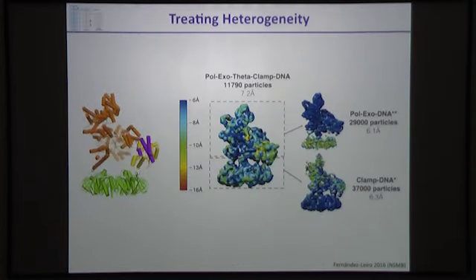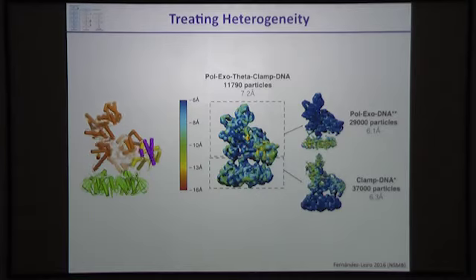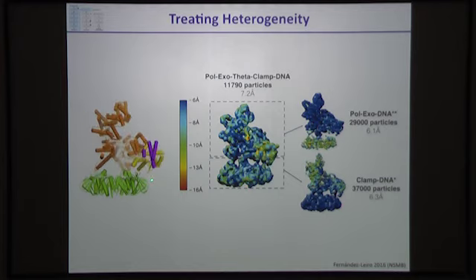This is another example from our polymerase data set, and I think it's quite illustrative of what can happen. This is a 220 kilodalton complex, and what I'm showing here is the range of movement that the particles are undergoing when you're freezing them. These are three different proteins bound only by a linker in between them, so the relations between these different domains are quite flexible.